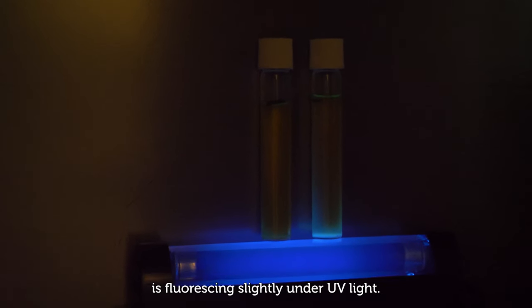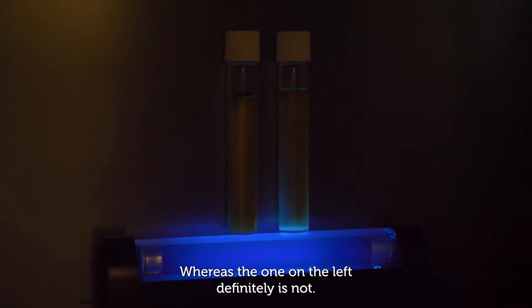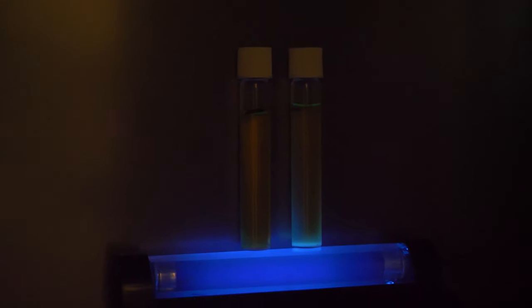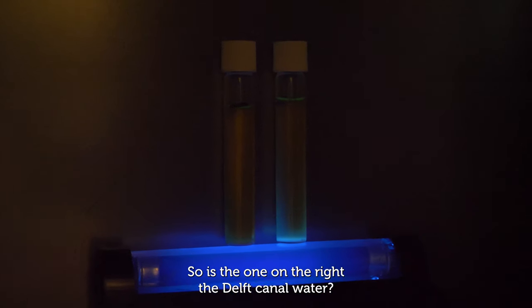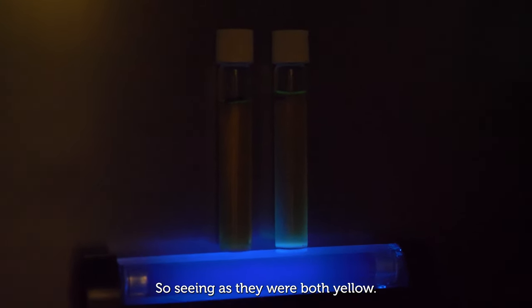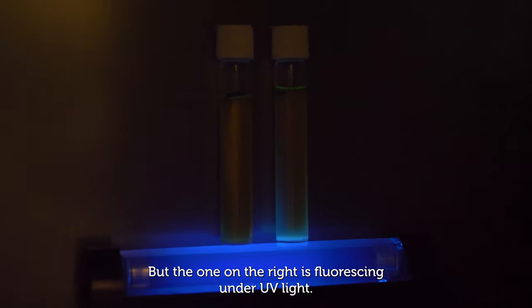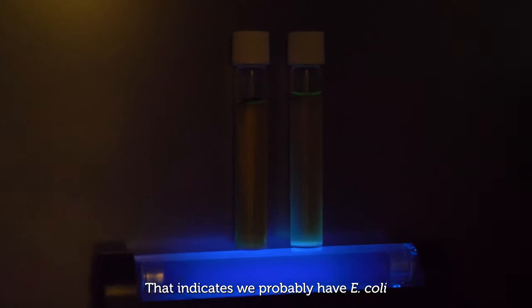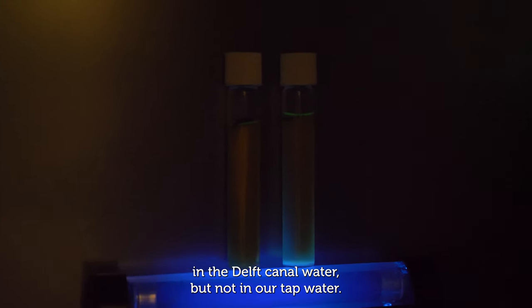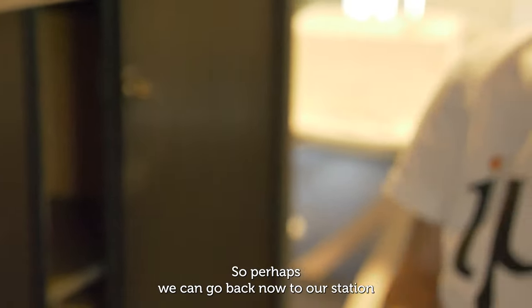It seems to me that the test tube on the right — the Delft Canal water — is fluorescing slightly under UV light, whereas the one on the left, the tap water, definitely is not. Both were yellow, but the right tube fluorescing under UV light indicates we probably have E. coli in the Delft Canal water but not in our tap water.